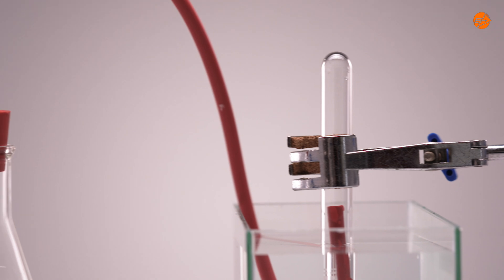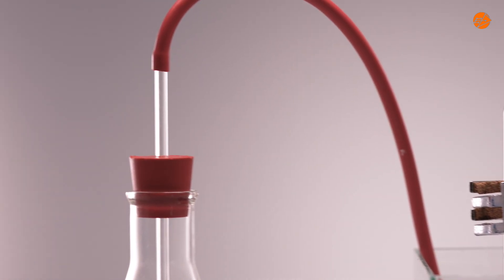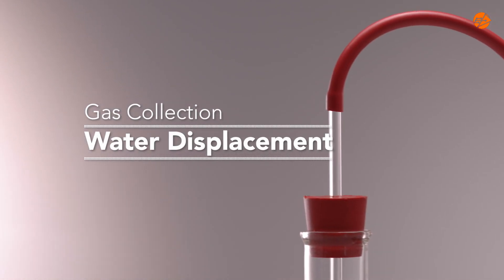For gases that do not dissolve in water, we can collect them using the water displacement method.